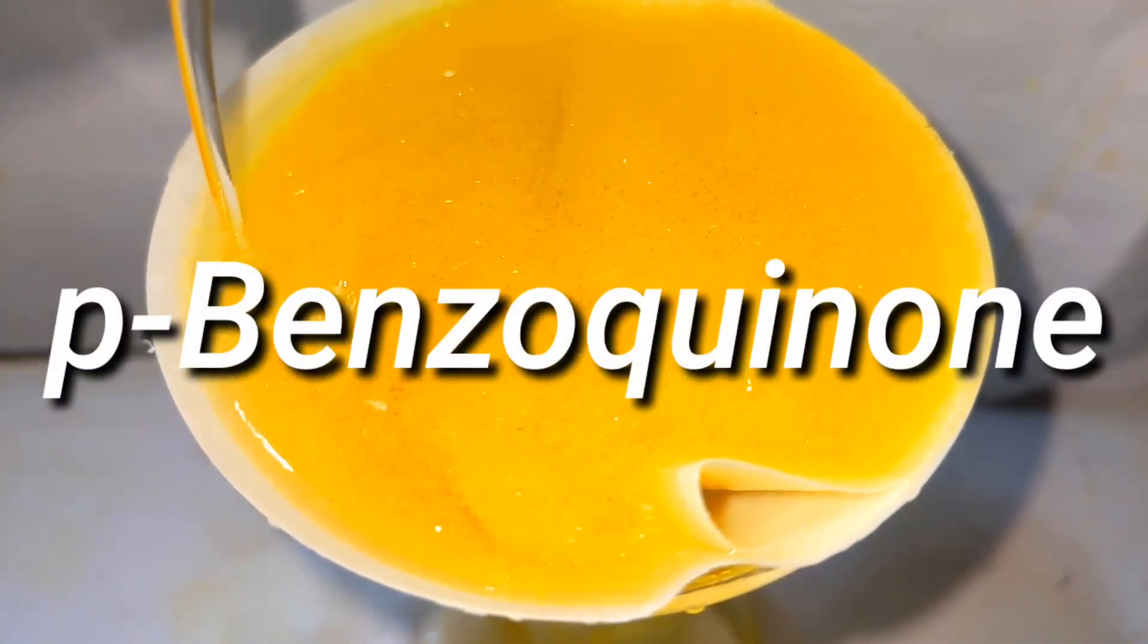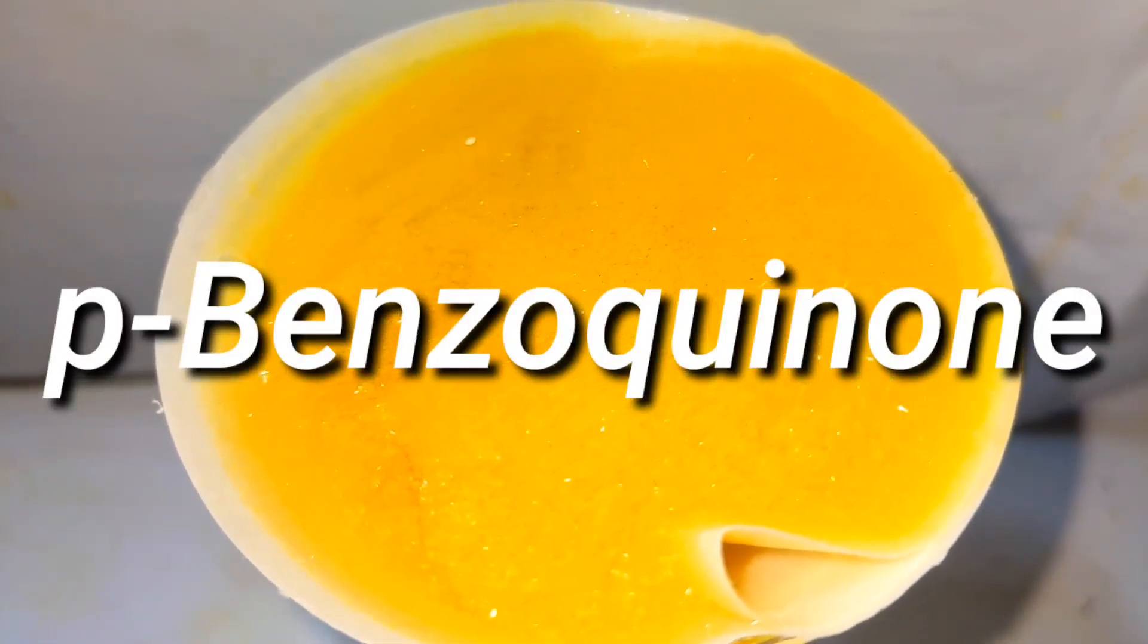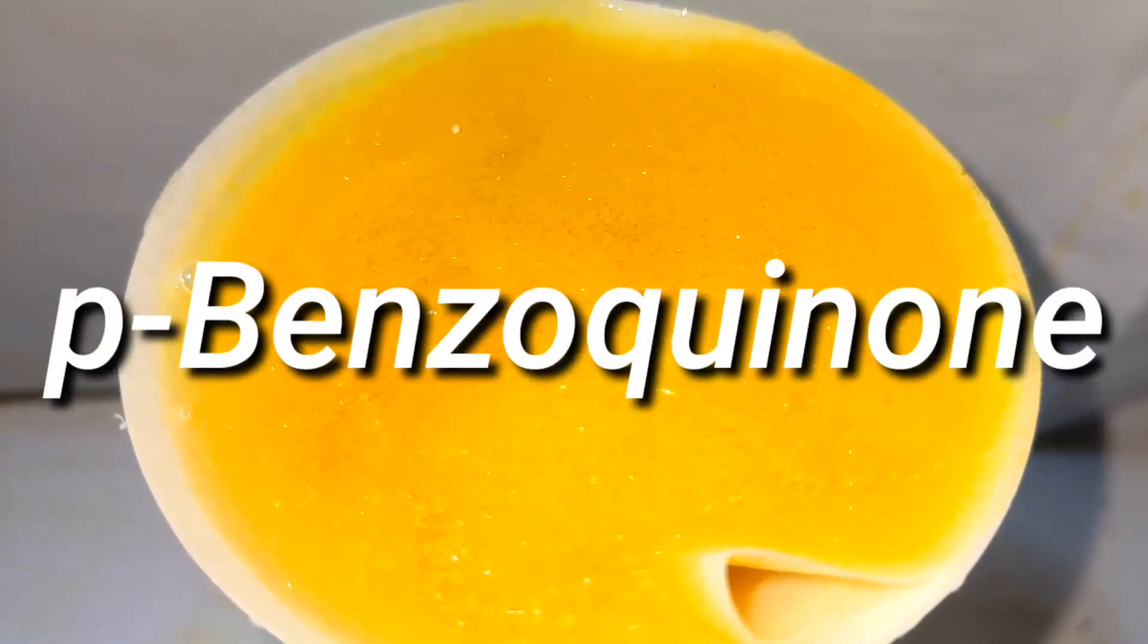Hello friends, in this video we will produce p-benzoquinone by the oxidation of hydroquinone.